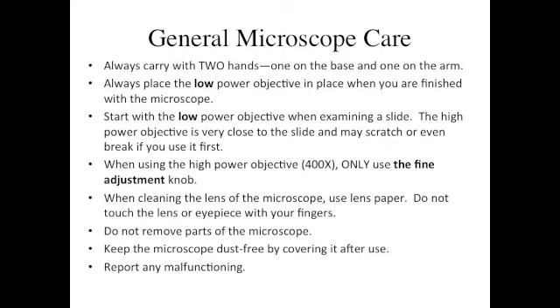When cleaning lenses of a microscope, always use lens paper. Never use your finger or any sort of other material. And don't remove any parts of the microscope. In addition, if there's any sort of malfunction with the microscope, please let Dr. Pacifica or me know. Finally, we want to keep the microscope dust-free by covering it with its plastic cover after use, and store it away properly in the cabinet.